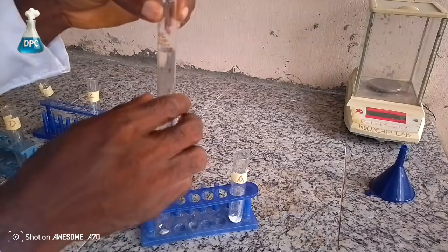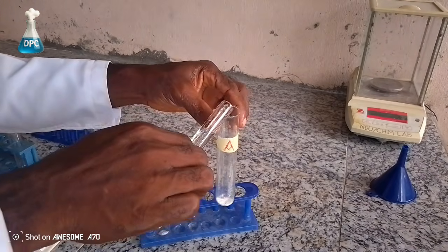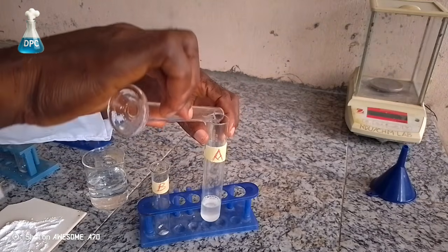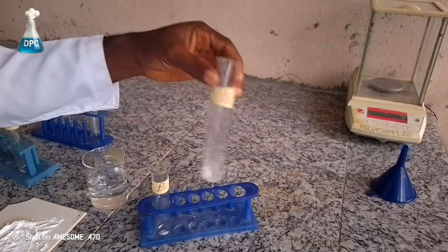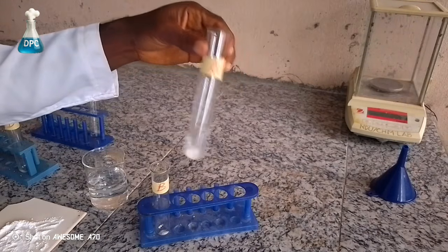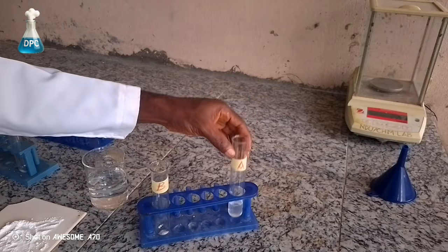You must ensure that all sodium hydrogen carbonate in the test tube is completely dissolved before you can carry out the reaction. Now that is 10 ml of water into test tube A. Try as much as possible to dissolve all the sodium hydrogen carbonate. We just need a true solution to be formed.